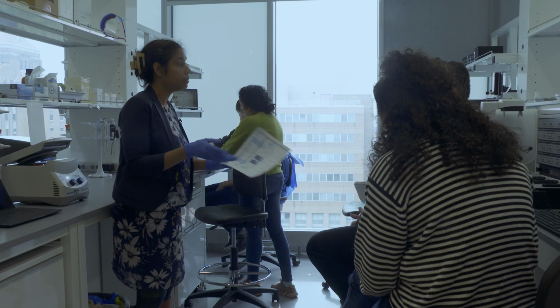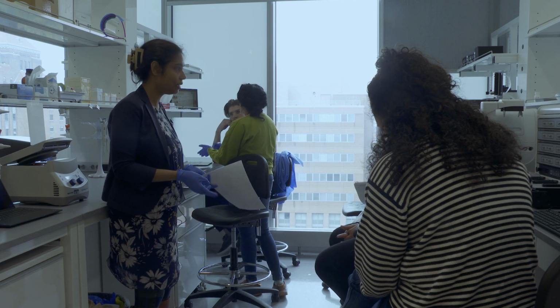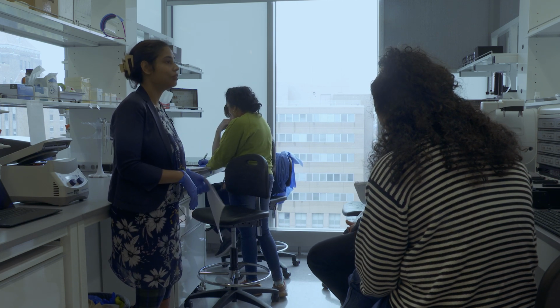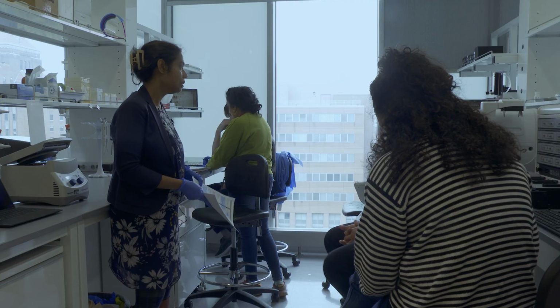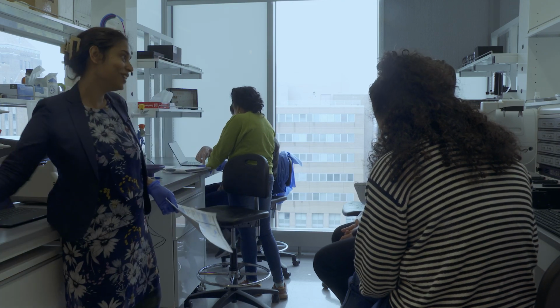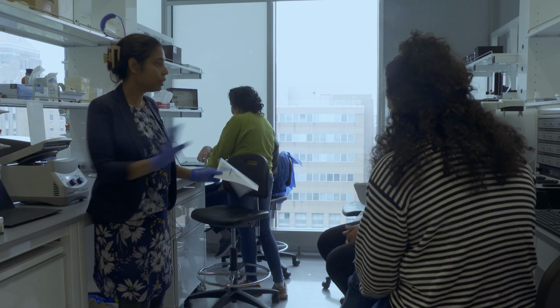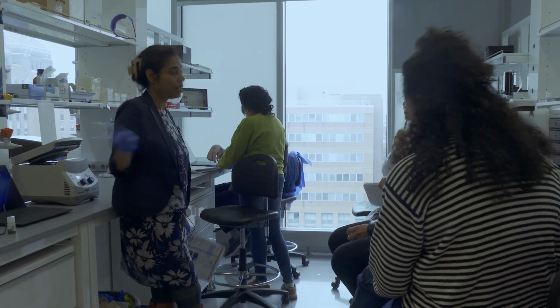So the gel band purification I explained is kind of the state of the art way lab scientists used to purify DNA, but now we have the beads. Let's say you are using SPRI or AMPure.